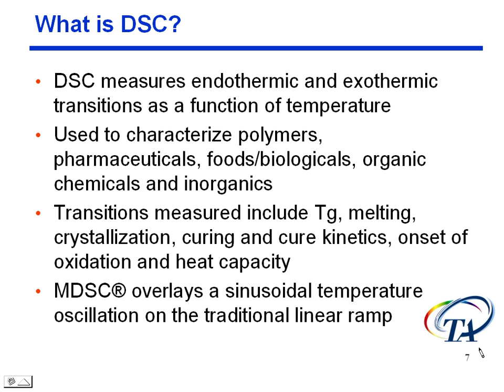The transitions that we measure with DSC are the glass transition, or Tg, melting and crystallization, and then also curing and cure kinetics, onset of oxidation, and heat capacity. And heat capacity is one that we're going to talk about here in modulated DSC, in addition to glass transition, melting, and crystallization.